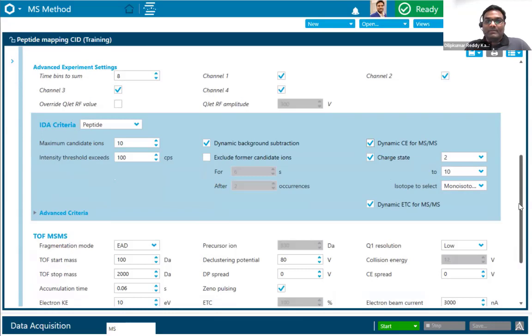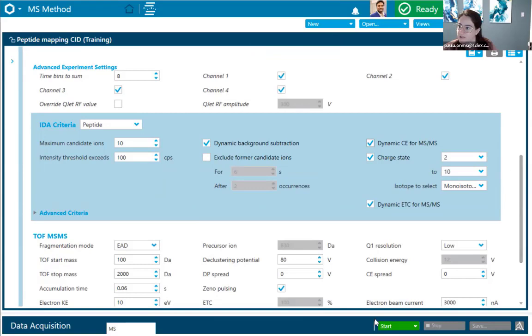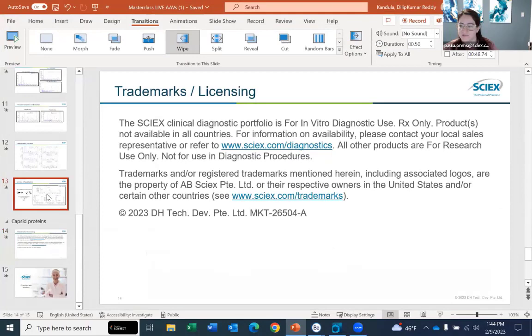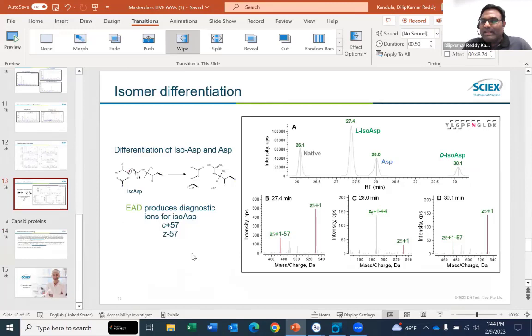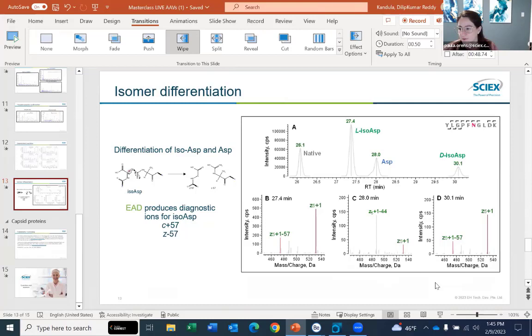Did we have any presence of C+57 fragments? Predominantly we got Z fragments with EAD. Similarly, with CAD fragmentation we mostly get dominant Y fragments. In this case, Z fragments were more abundant. It's also worth noting that EAD doesn't only produce C and Z ions — depending on the energy level used, we can also identify B, Y, A, and X ions as well.